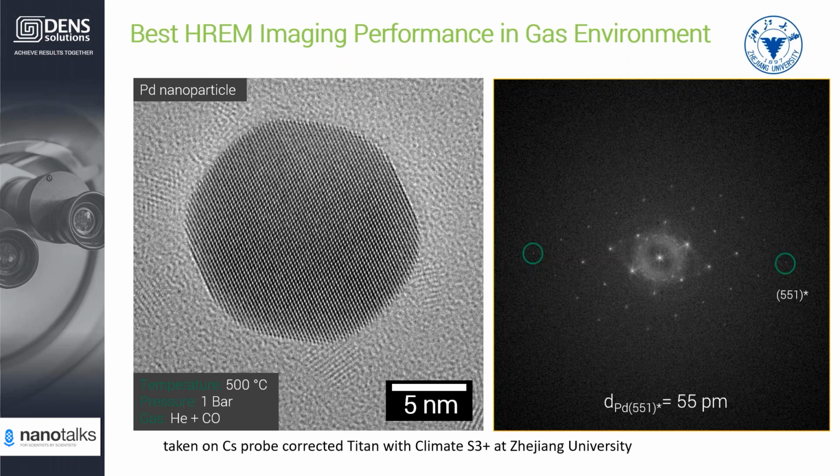Think about it like changing the air in your room. You just open a tiny window in your room, and then this refreshing period will be very slow. So I would say this is a kind of physical limitation which can be shortened by the nanoreactor design, and can be shortened by the connection tube length.